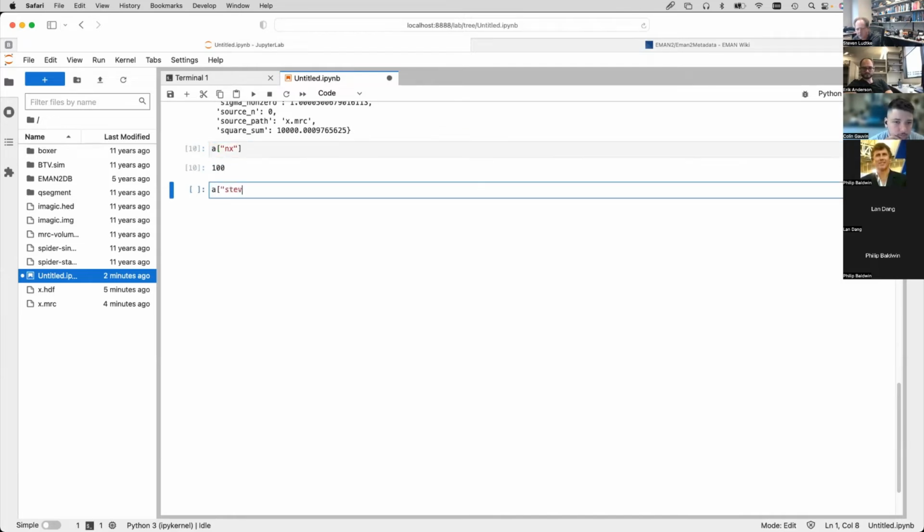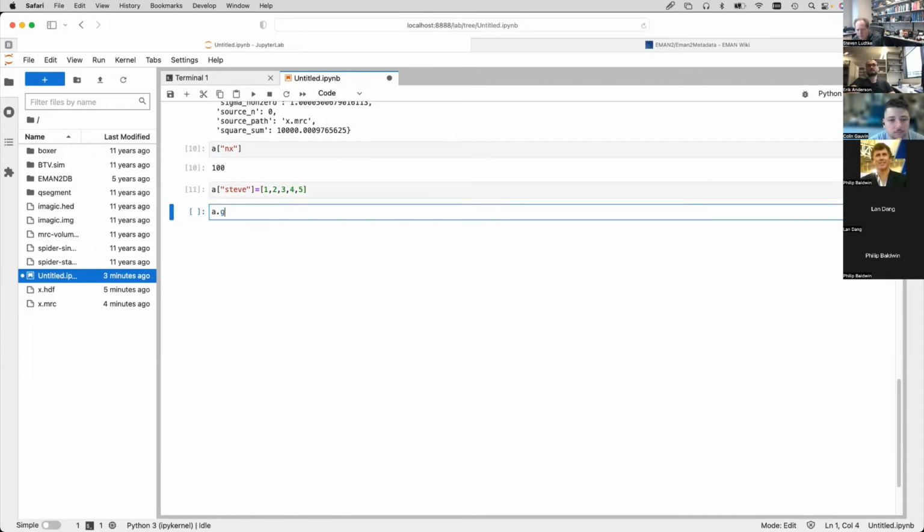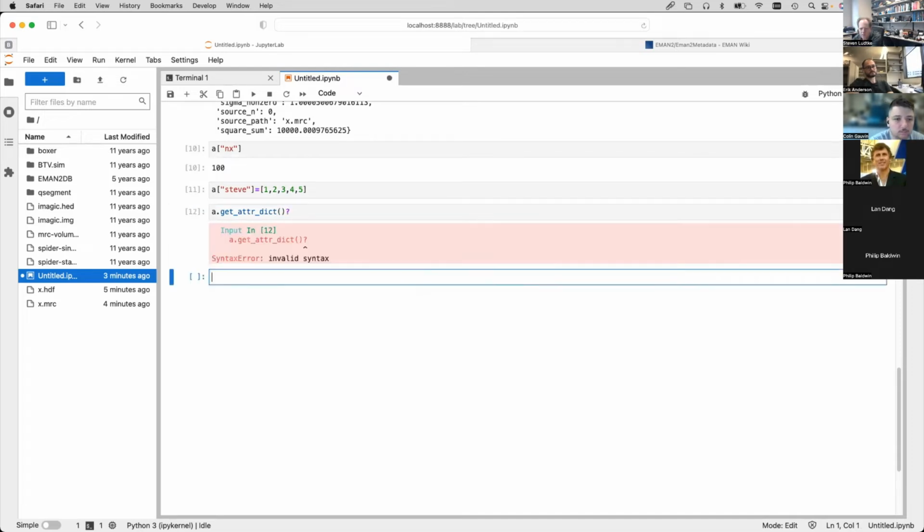I can say A of Steve is equal to 1, 2, 3, 4, 5.